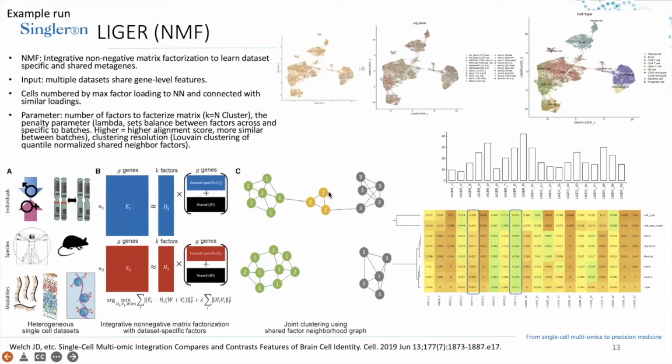It is believed that this algorithm is more robust. Yeah, so the result of Liger also shows that the batch correction was successful with regard to the cell types, but similar to CCA, it may be overcorrecting a little bit.